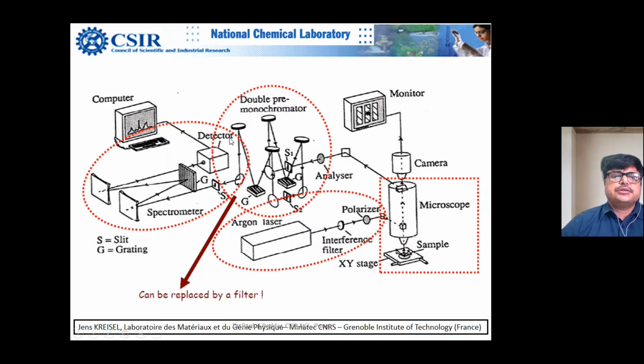So this is a very important slide. Here, this is the source part, where you can have a polarizer, etc. This is the focusing optics. Your sample sits here, and this is basically the microscope. Here you decide how much area you would like to expose, whether you select 50x or 10x optics, and then the Raman scattered light returns along the same path and enters this red circle.